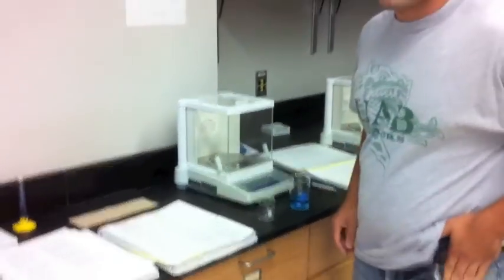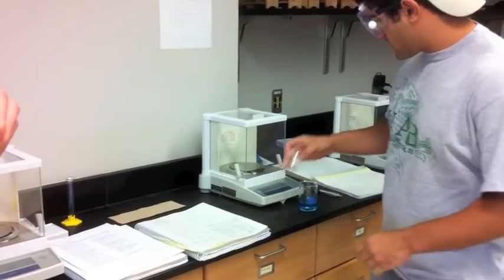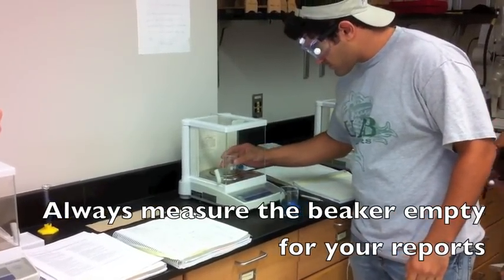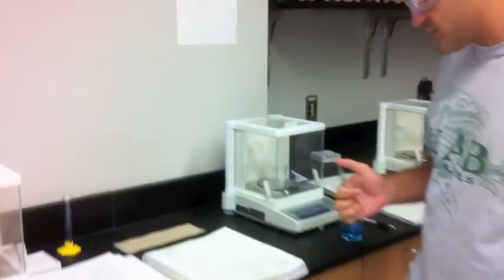Now to start we're going to tare it. Now I'm going to measure the beaker by 50 milliliters. You get about 30.37.